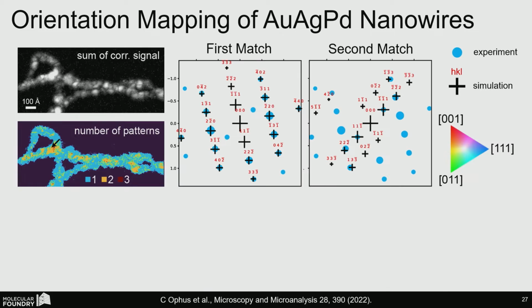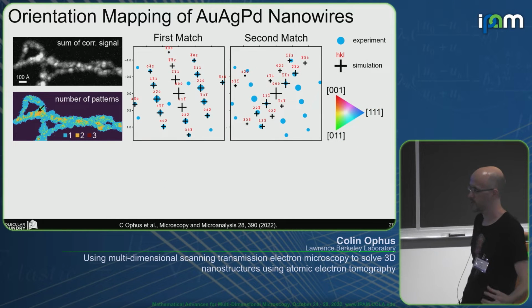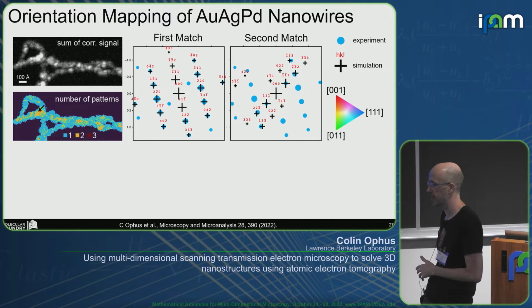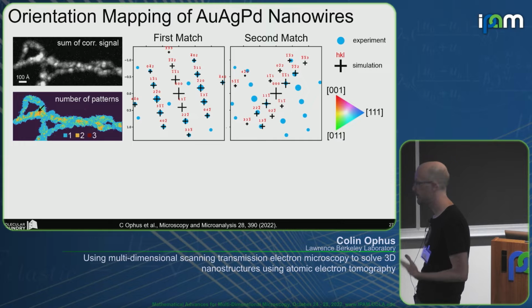So our approach is to use a library of diffraction patterns and then fit it in this rotational SO(3) space here. And we've explored a bunch of different ways to do this algorithmic fitting, but I'm still interested in talking to possible math experts in the room about this matching in Euler angle space of these patterns. We ended up using a hybrid method where our library is matched to the experimental data using a Fourier transform for the in-plane rotation in polar coordinate space, and then just using brute force numerical taking the maximum in the other 2 Euler angle directions. And that was the fastest method I've been able to devise so far to do this pattern matching. But it works pretty well.